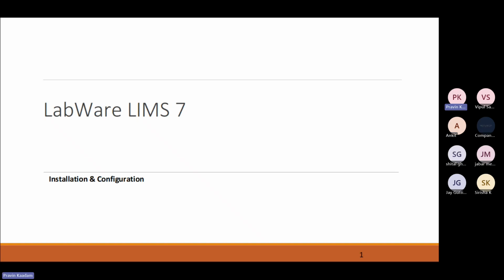Today we will see how the LIMS is installed, and after installation, which are the basic configurations that you, as an IT administrator, are supposed to configure. Okay, so let us go step by step.